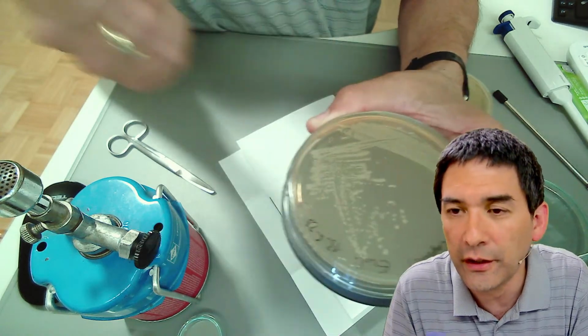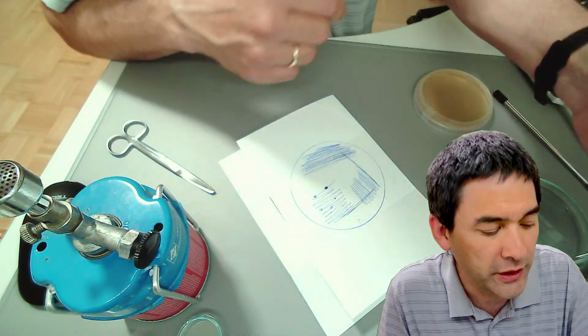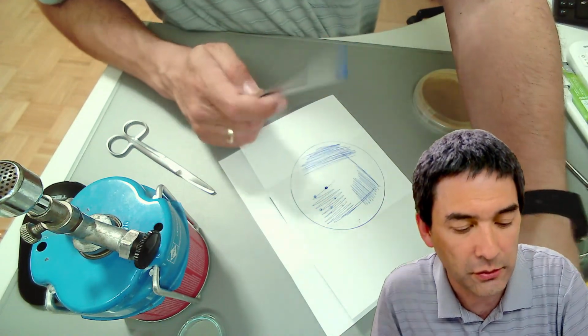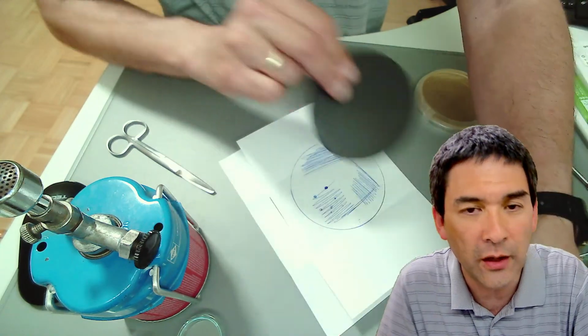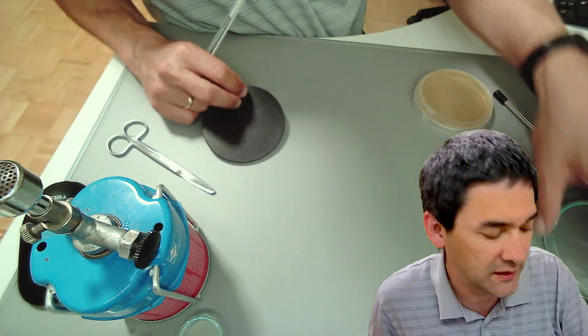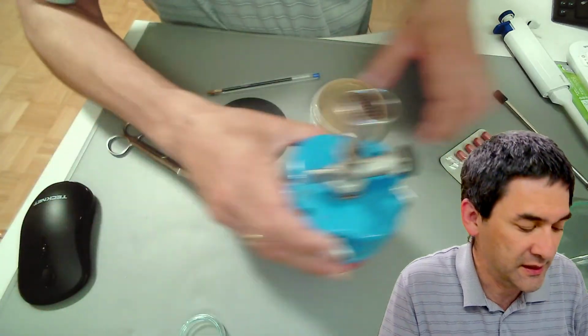I also see over here in the comments already that some people have petri dishes that are made of glass. Sure, that's indeed possible, but the ones that we now routinely use in a microbiology lab are disposable ones that are made of plastic.